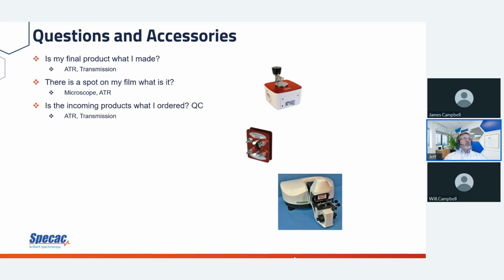Incoming product. I have a reaction that I need, and I've got a trailer load, or a train car out there. I need to test that to make sure that my incoming raw material is what I ordered. Doing that by ATR or transmission is very quick. Now I made my product. Is it finished? Did I get the product that I was looking for? Are all the reactants gone? Or if they're not, did I do my measurements correctly? Is there an imbalance?